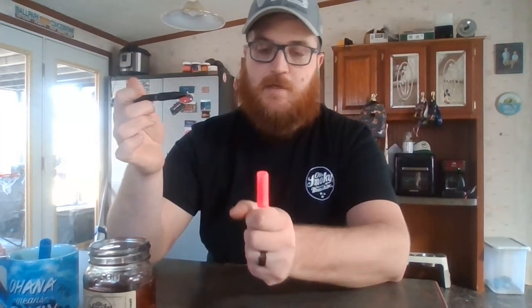I would flame, replace the cap, place that back in the holder. One of the biggest things that I'm doing is holding the inoculation loop up so that it doesn't hit any surfaces and get any more bacteria on there.